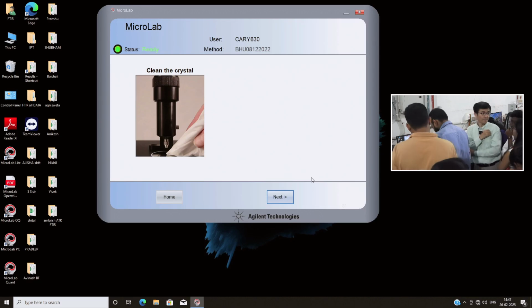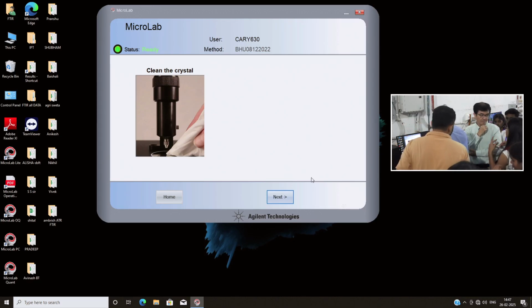So you are telling that I0 will be air, and I will be either the solvent or the sample. In the first measurement I is for solvent, and now we are taking it for the sample. Right. So I0, you told in the first case I0 was 0, for which we were getting the noise in the spectrum.